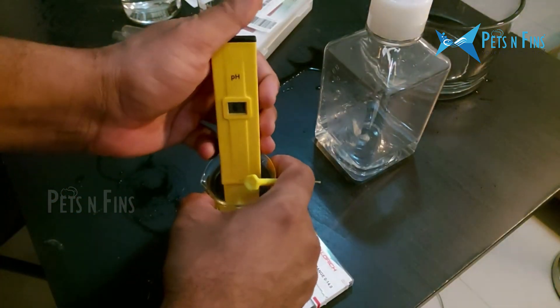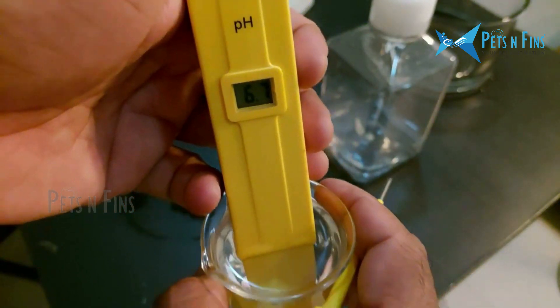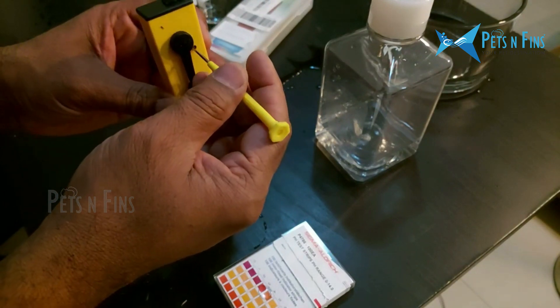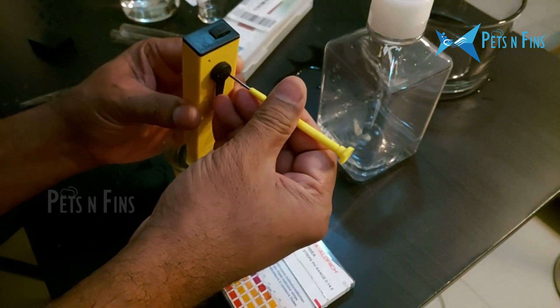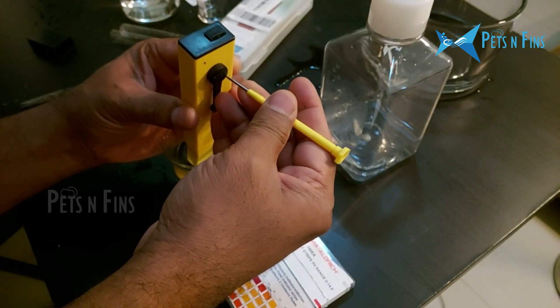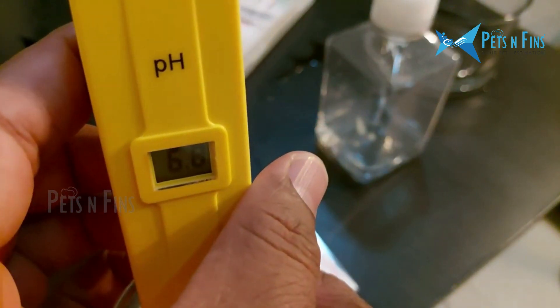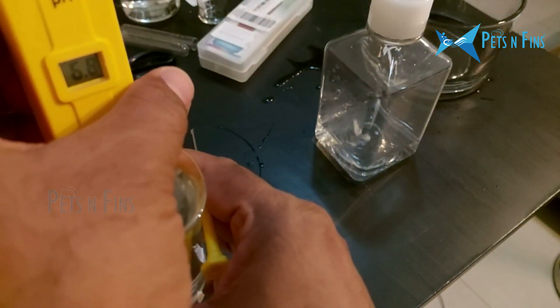Now our reading is 6.8. The meter shows 6.7, which is already close to 6.7. Put the screwdriver in here and adjust. Look at the value — it comes to the same. According to the correct reading, it should be 6.8. Now the buffer is calibrated to 6.8.